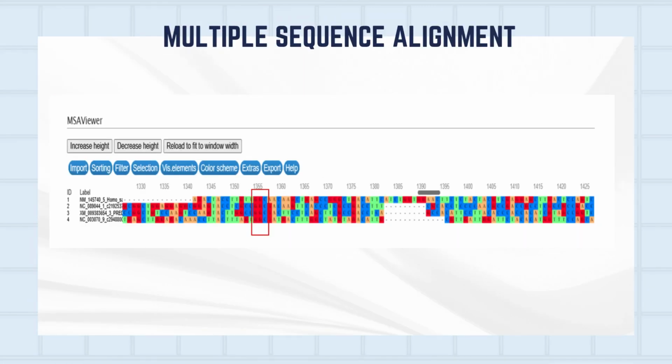Hello, so now I will present the MSA task. I use comparative genomics to analyze glutathione S transferase across diverse life forms such as human, Arabidopsis, rice, and banana. GST are detoxification enzymes. To compare them, I use MAFFT, a bioinformatics tool, to perform multiple sequence alignment.